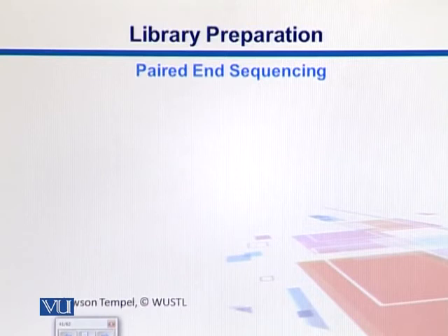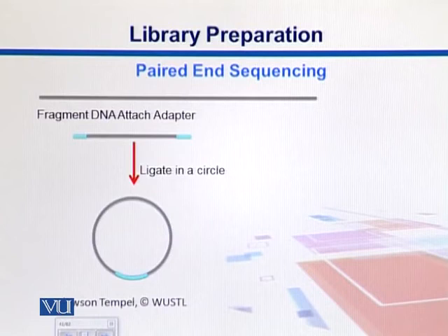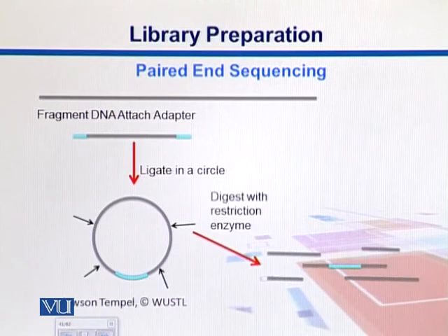What we do here is we fragment DNA and attach adapters. Then we ligate it into a circle. Then we want to skip most of this circle and just take the DNA which is around those regions, so we cut it with a restriction enzyme. Then there is one fragment that contains these adapters. If we take them, we don't need to take the rest. This kind of technique is called paired end sequencing.